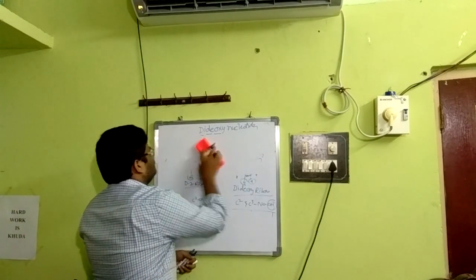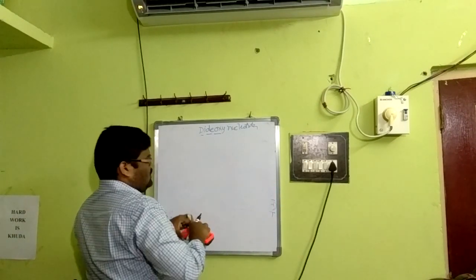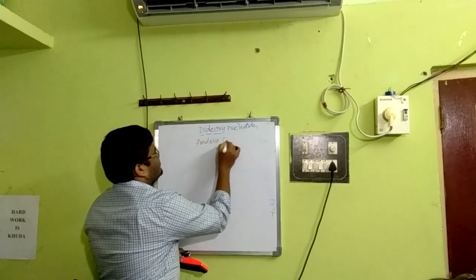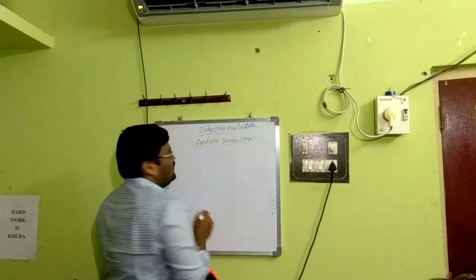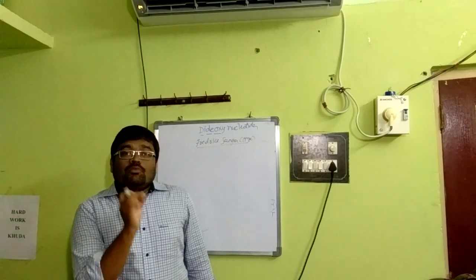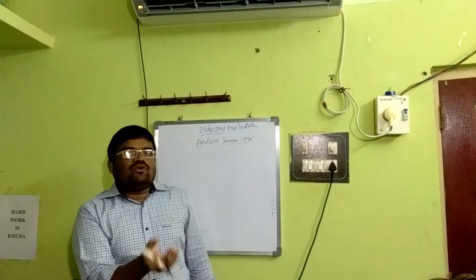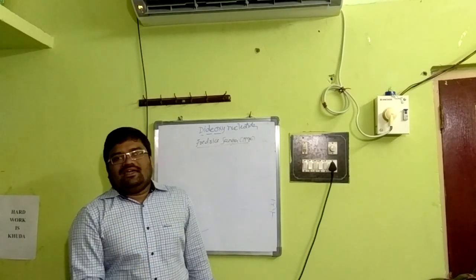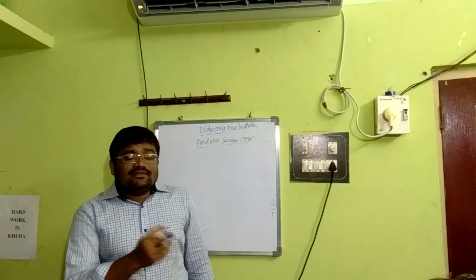And regarding the other issues, the dideoxynucleotide method was developed by Frederick Sanger in 1980. As far as my knowledge goes, he is the only person who won the Nobel Prize twice in the field of medicine. The first time he got it for insulin, and the second time for the nucleotide sequence of a viral RNA. And he designed this technique, and they currently follow it.